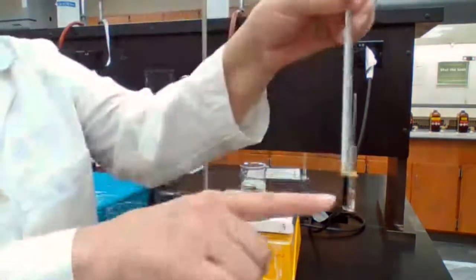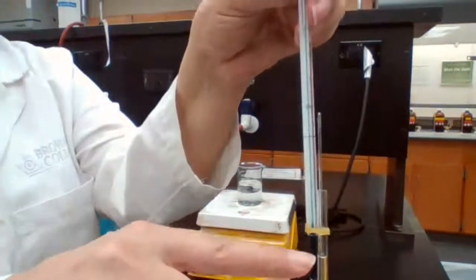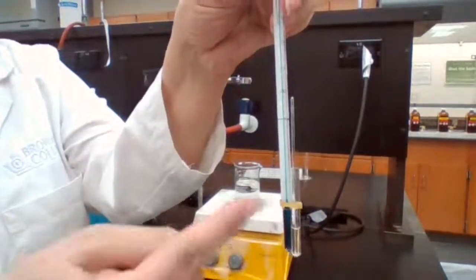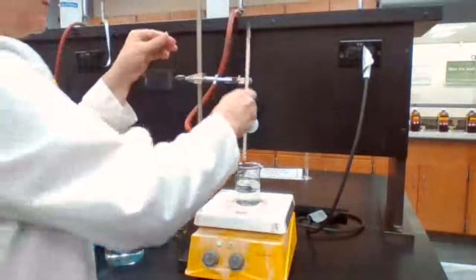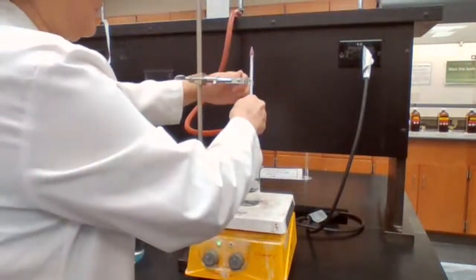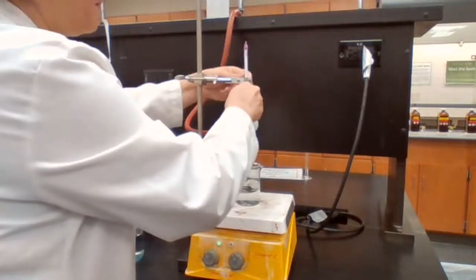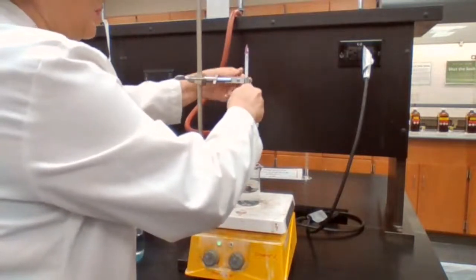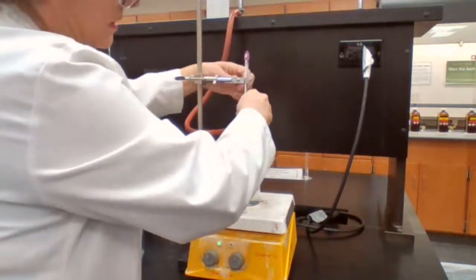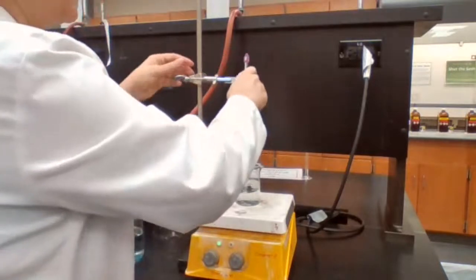Okay, I added about 5 to 6 drops of this liquid into the seal tube, and it's much easier to see the bubbles coming out of the liquid. I'm going to secure it with the thermometer and place it in the hot water bath at this point. The unknown sample should be inside the water.